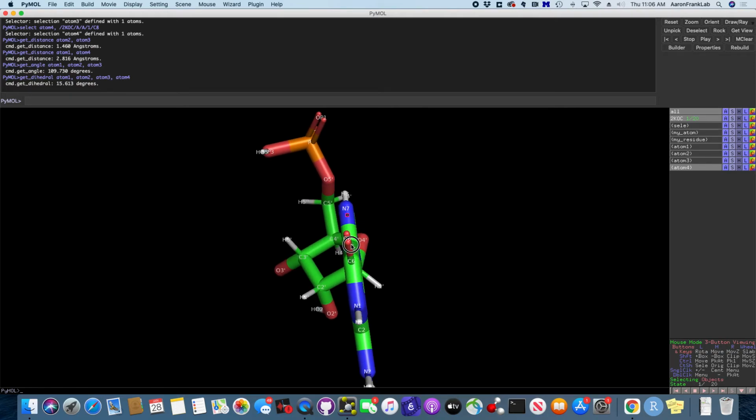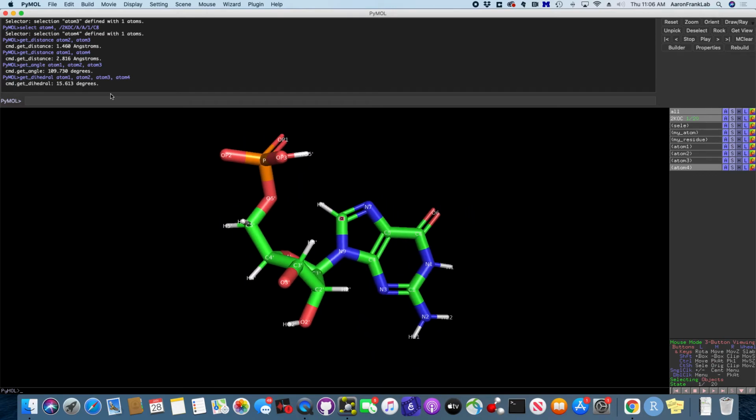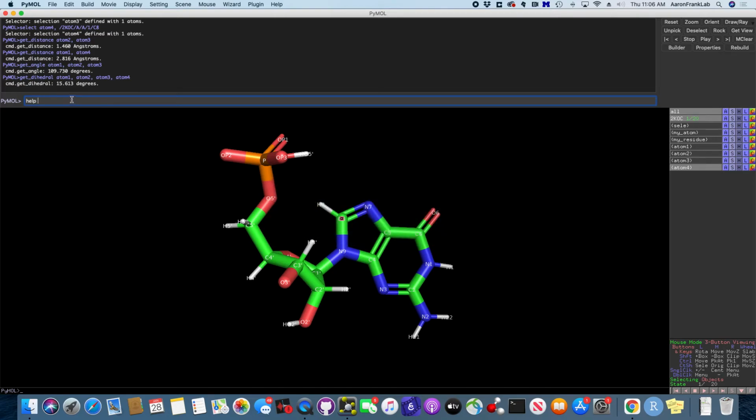The dihedral angle should be very small. Now for all of these commands, and most commands in PyMOL, if you have questions, and you already know the command, you can actually get help directly from PyMOL by using the help command. So you say help, and then the name of the command you want to get some help on. So in our case, it's either one of these. Let's say get distance, and the exact same information that's stored on the website is available to you right here. And so provided that you know what a command is, it makes it easy to get information about it.